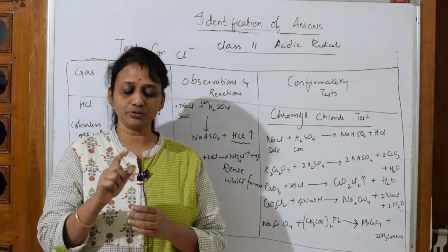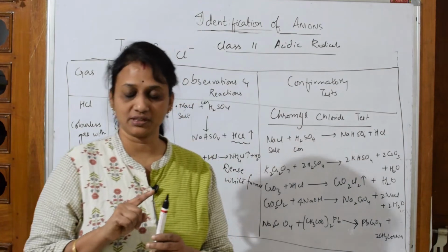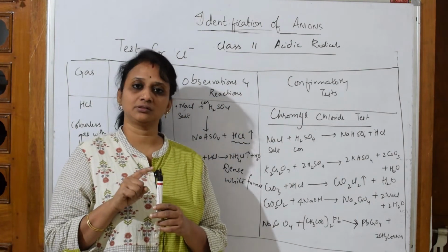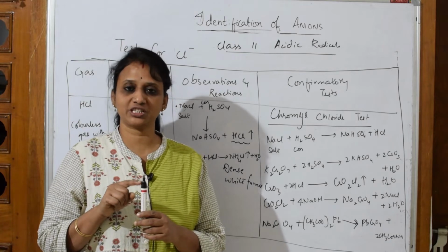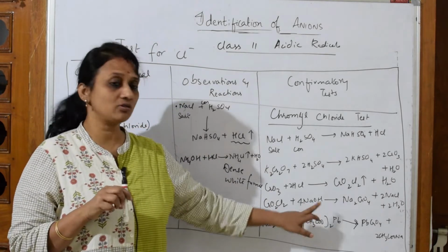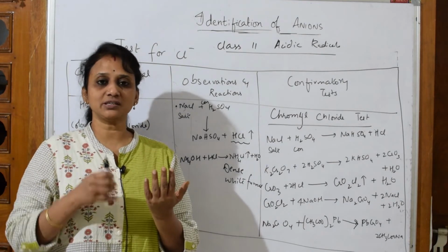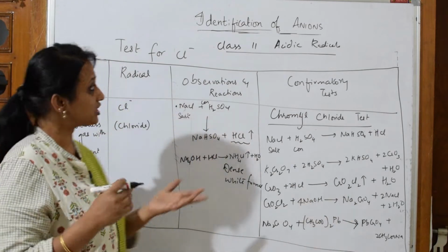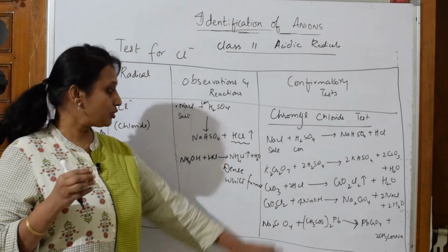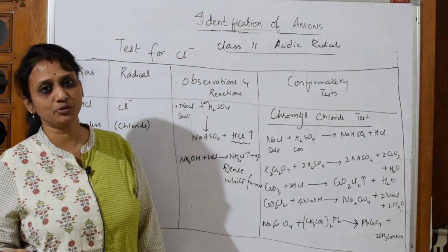First, you're going to take a test tube and add salt into the test tube. After that, you are going to add potassium dichromate to test tube 1, which has salt. In one more test tube, you're going to keep sodium hydroxide ready. Now we have the salt with potassium dichromate. In the last step, you're going to add concentrated sulfuric acid to the test tube containing potassium dichromate.